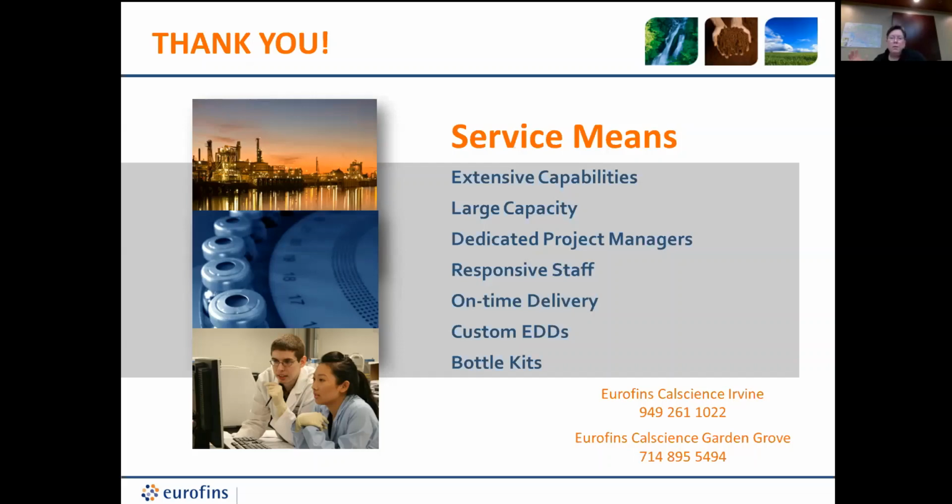I mean, if it's high levels of oil and grease, even though it's not preserved, and you're well over your permit limits, does it really matter at that point? So we wouldn't re-preserve it in the lab unless you brought it into us and said something, and we could preserve it immediately. Chances are we wouldn't re-preserve it.